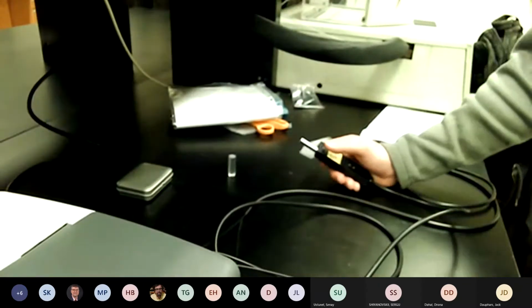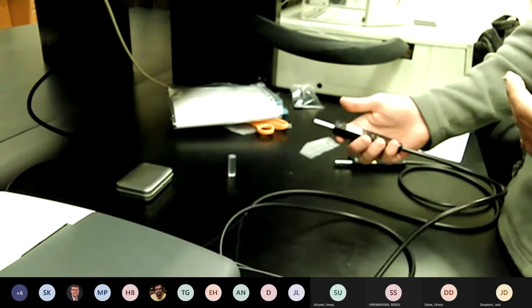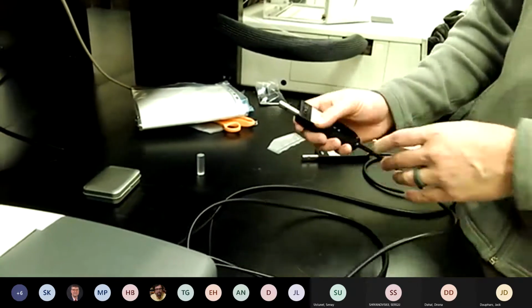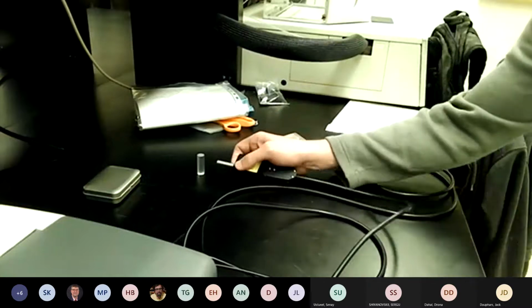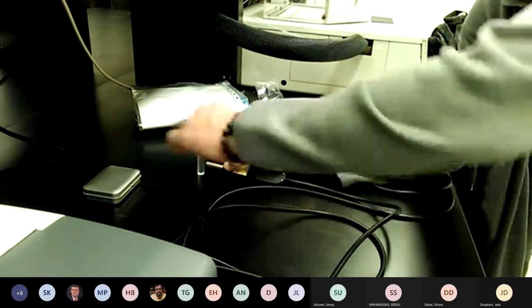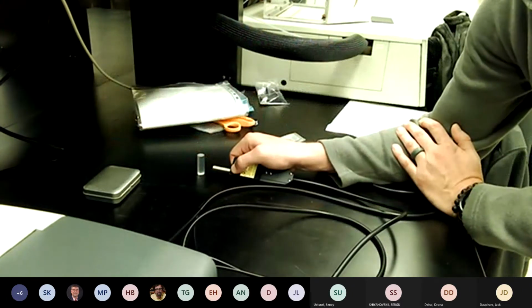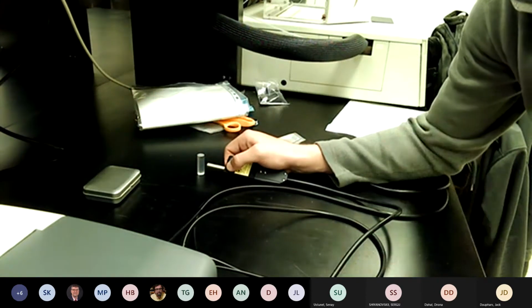So this is kind of the crude way to do it. You can set up with say a ring stand or some kind of holder for your sample. But this works fine for general purposes. So you'll do single acquisition. You want to hold this pretty steady and give it maybe a few millimeters of space. If it's too close, you risk the laser going completely through the sample and you don't see it, and you get a lot more noise. The same thing if it's too far away; you want that focal point to hit right in the middle of the sample.